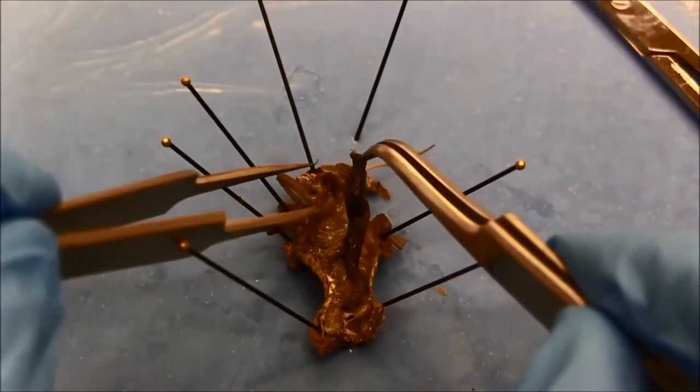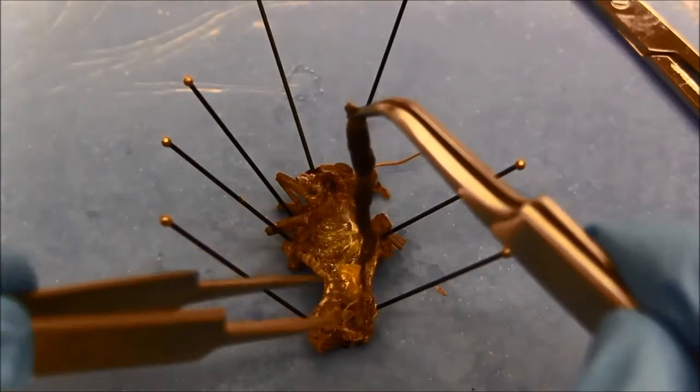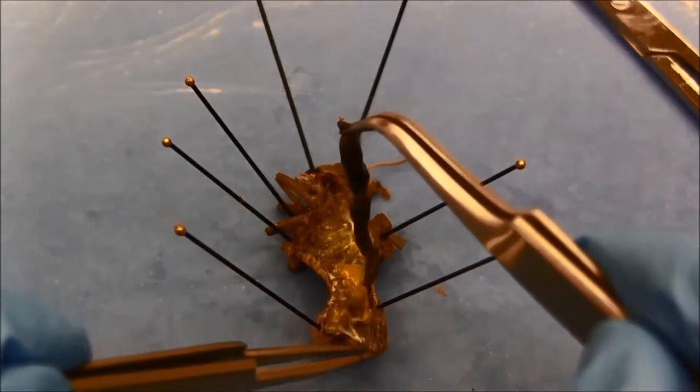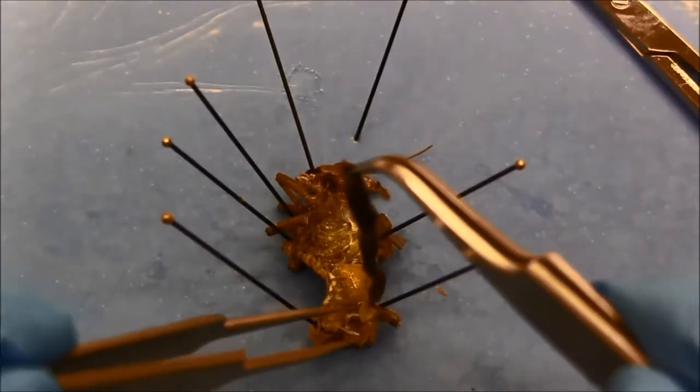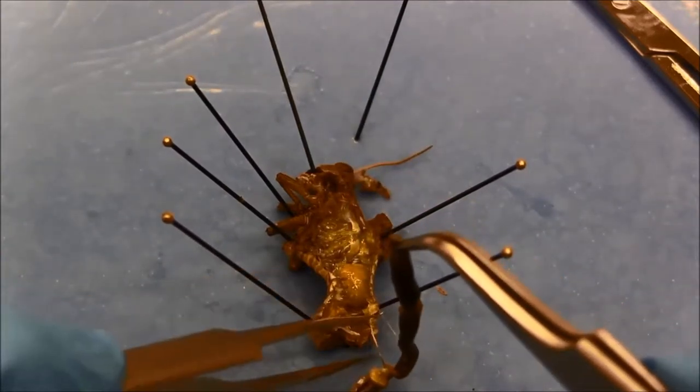I carefully pull out the digestive system. I have a grasshopper male here. If you dissect a female, you might want to remove all the ovaries and fat bodies before you pull out the gut.